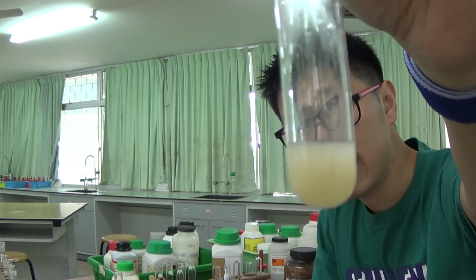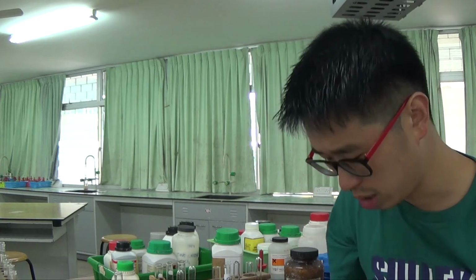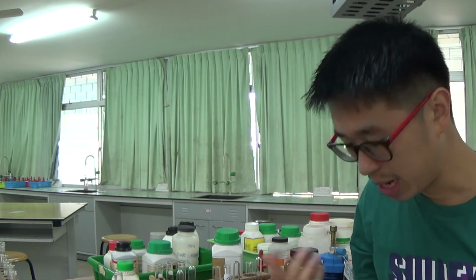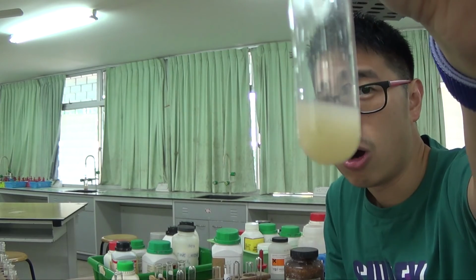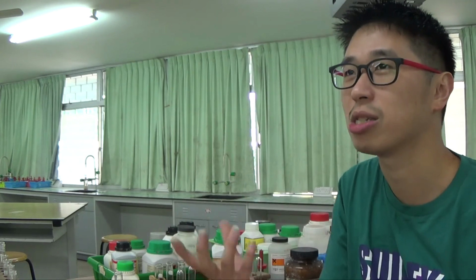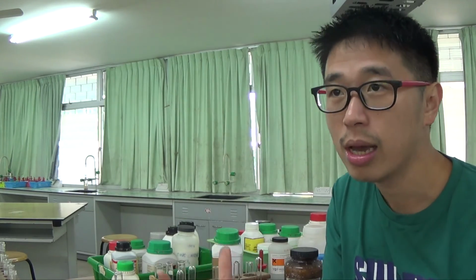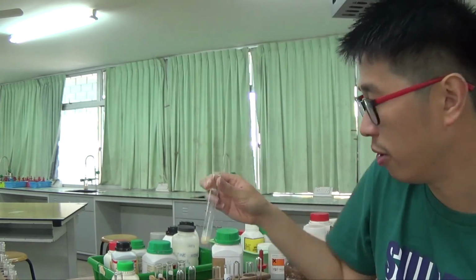Now the color here was the precipitate of barium sulfate. I showed you the precipitation reaction earlier: Ba2+ and SO4 2- give you BaSO4. We know that one is a white precipitate. So when we add barium nitrate to it, we saw an off-white because there is a bit of browning, but essentially it still tells you sulfate is present. It should be white, but because of the interference from the orangey, yellowy color of the iron 3+ in solution, you see a little bit of browning there, but it confirms the sulfate is present.